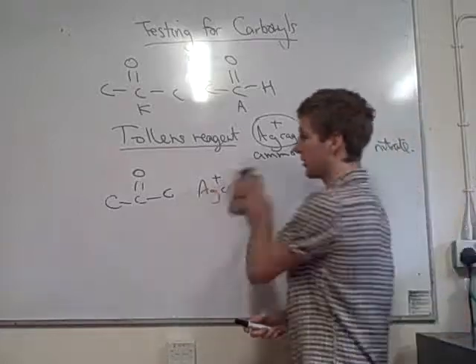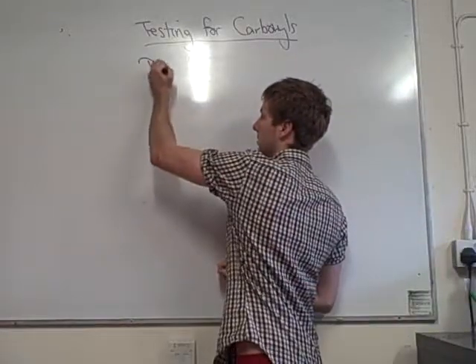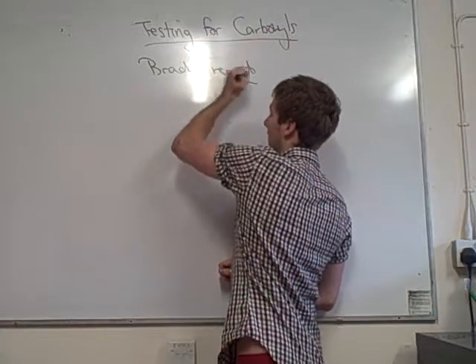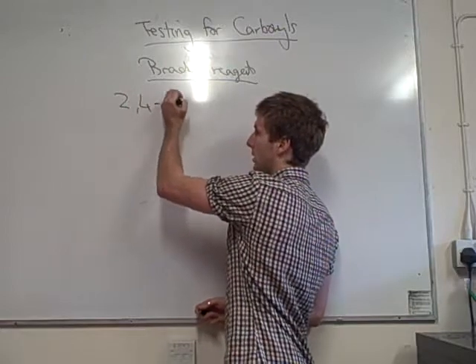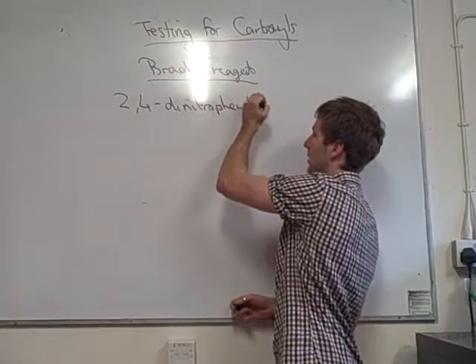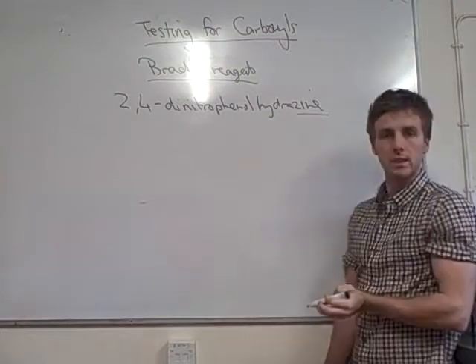There's another test we can do. That is Brady's reagent test. Brady's reagent. And you're going to love this name, it's really easy to learn. In fact, I should probably make it a bit longer. 2,4-dinitrophenylhydrazine. I'm just going to highlight the bit at the end there, hydrazine.